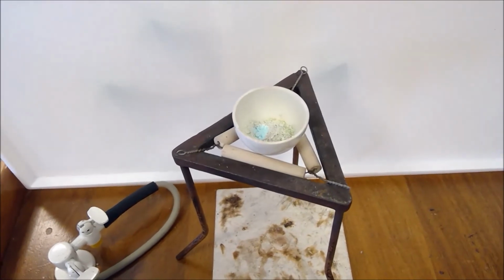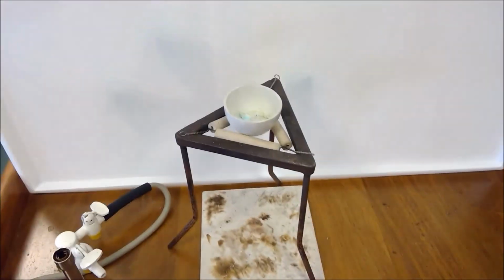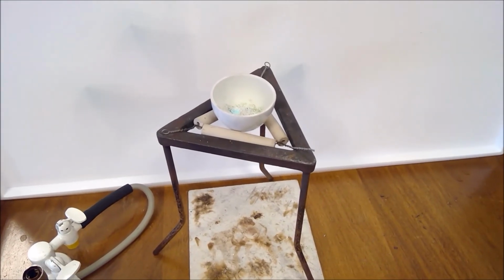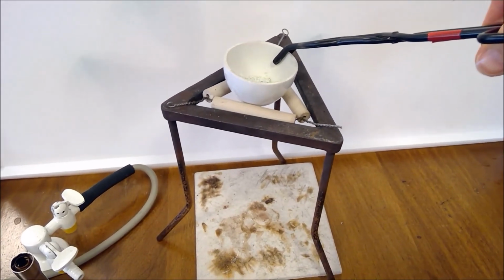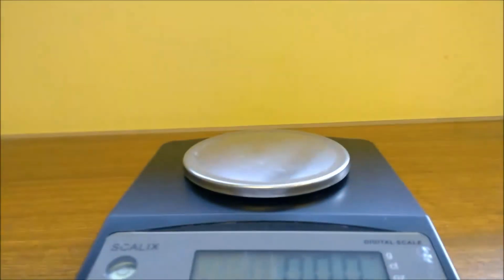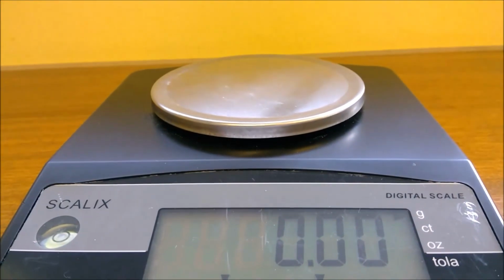Okay, and then we're going to use another heat-proof mat to act as a tray so that we can transport our crucible and we can go and reweigh it. So carefully going to pinch the sides of that, pop that down there. I'm going to move you guys over here, ready to record the mass.